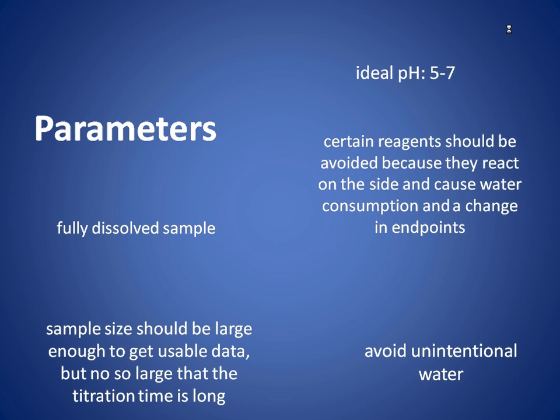The main advantage of Karl Fischer is that it provides a specific detection of water and is an easy way to detect the presence of moisture. A disadvantage includes the volumetric method having a 50 parts per million limit for titration to work. Also, the water should be easily accessible in order for it to come in contact with the titration reagent.